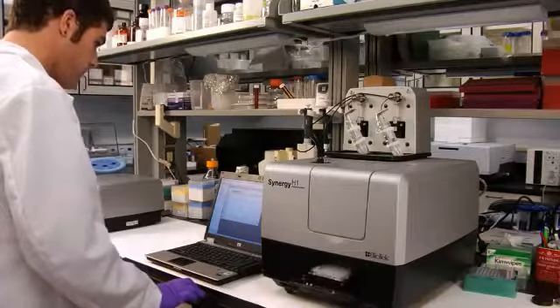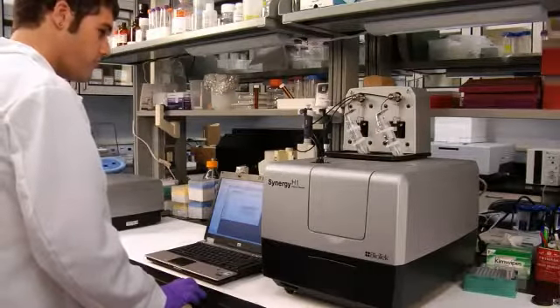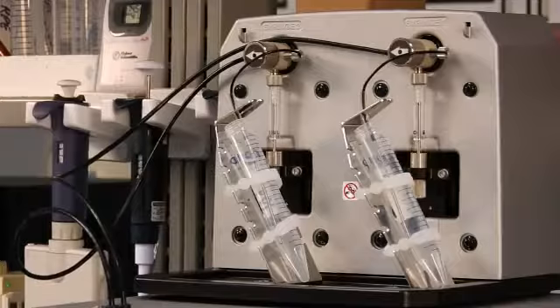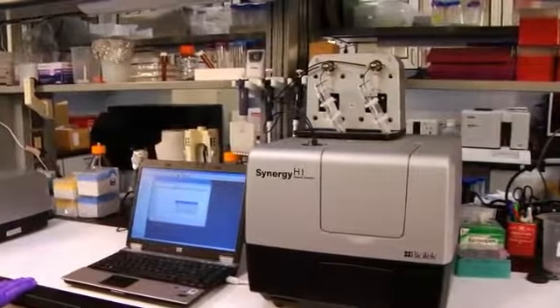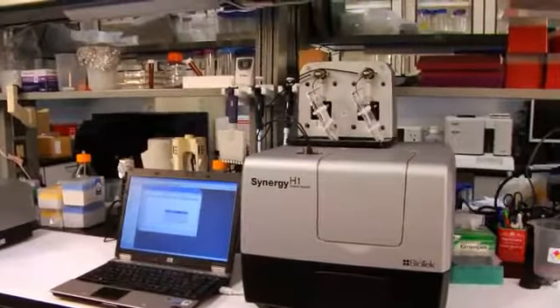An optional reagent injection module is available. This module is used to automate inject-and-read assays such as flash luminescent luciferase or fluorescent ion channel assays.